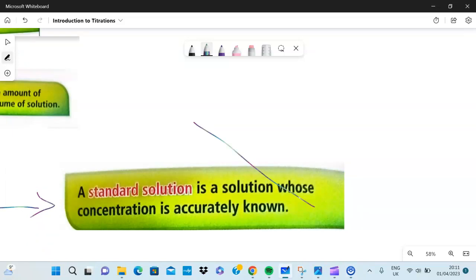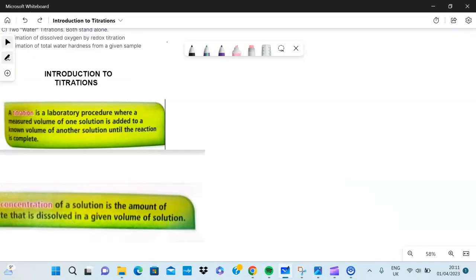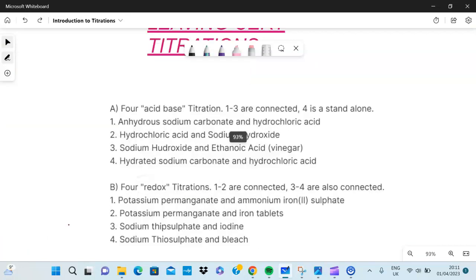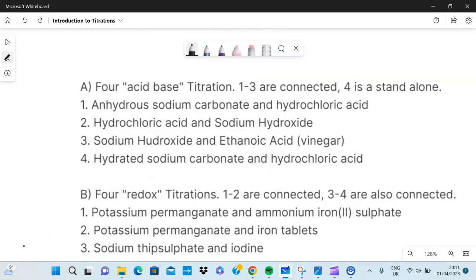For this video I'll be using the example of the very first titration that we have to do and that is anhydrous sodium carbonate with hydrochloric acid.